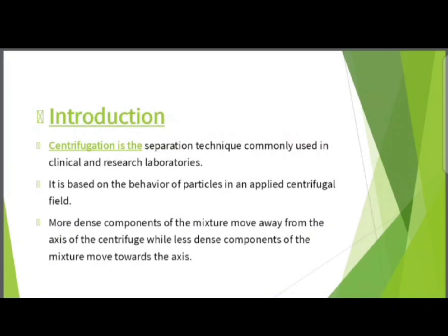Centrifugation is the separation technique commonly used in clinical and research laboratories. It is based on the behavior of particles in an applied centrifugal field. More dense components of the mixture move away from the axis while less dense ones move toward the axis.